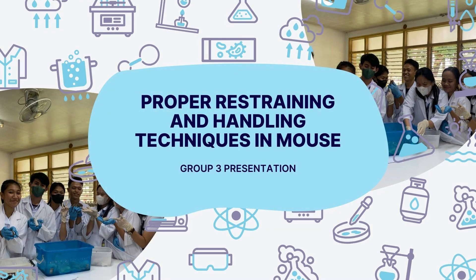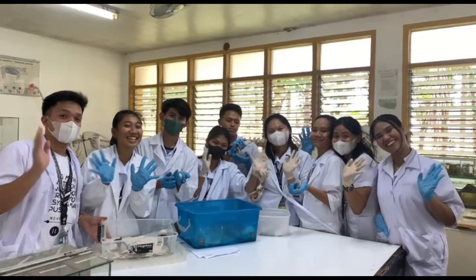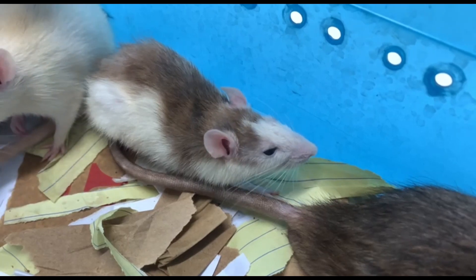Hello everyone. We are from Group 3 and this is our video presentation on the proper restraining and handling techniques in mouse. Understanding the proper restraining and handling techniques is important when working especially with laboratory animals.